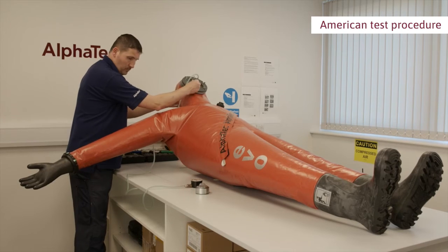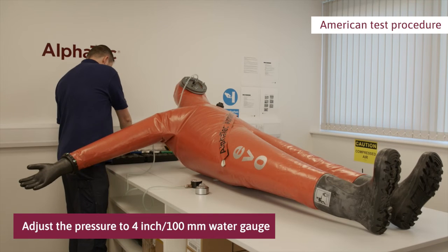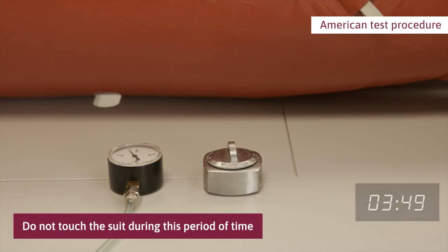When the pretest expansion pressure has stabilized, adjust the pressure to 100 millimetres water gauge. This is the test pressure. Set and start the timer and wait for 4 minutes. Do not touch the suit during this time.